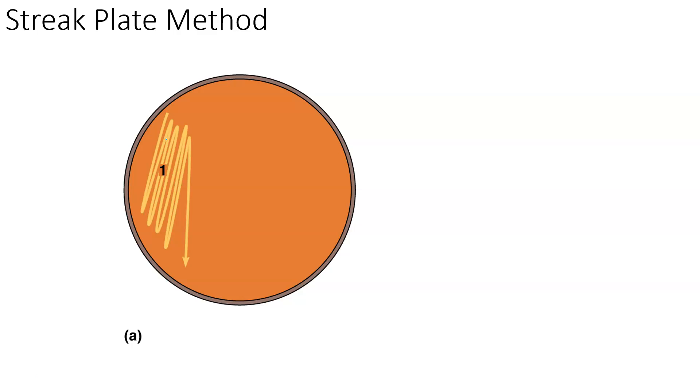Ultimately you need to take your loop and you need to streak it along this path in one quadrant of this plate. Now if you divided this plate into four quadrants you can see that primarily we're working in the first quadrant with our most concentrated solution, our most concentrated sample.